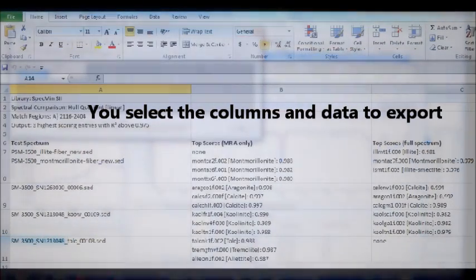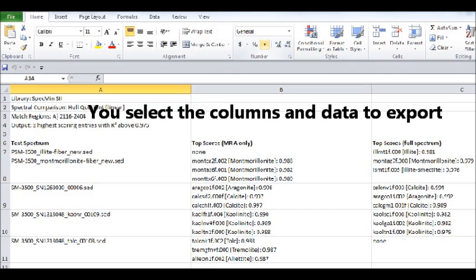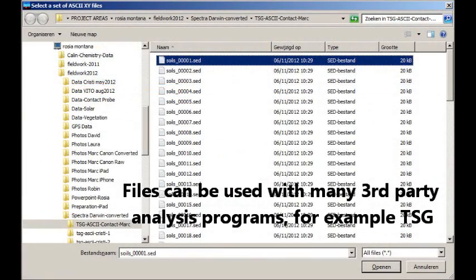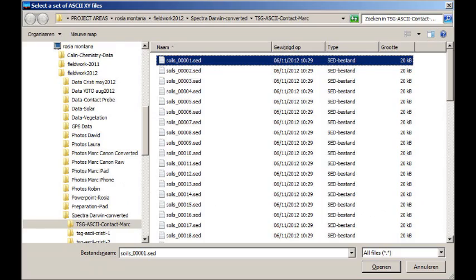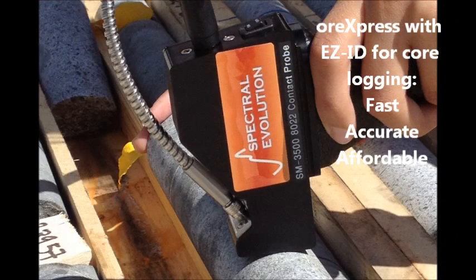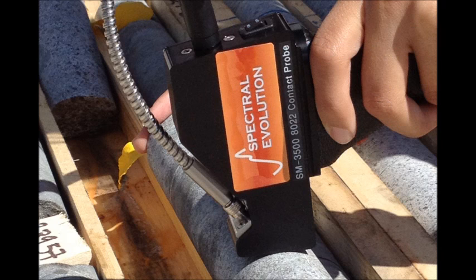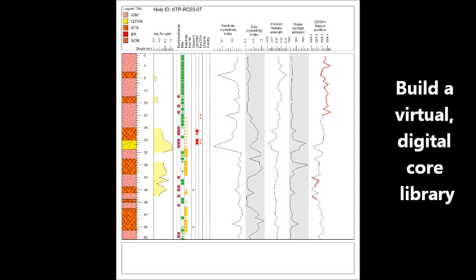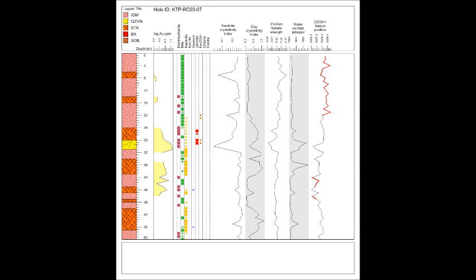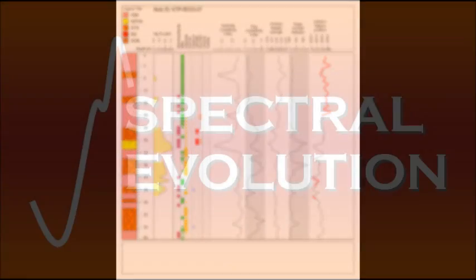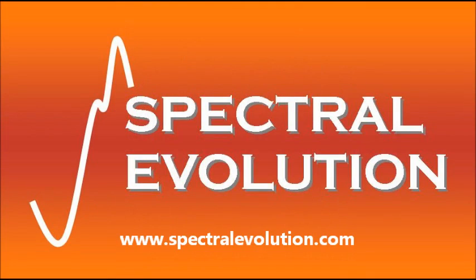To process your Darwin ASCII files into Excel spreadsheet format or import the ASCII files into another software program like TSG. ORExpress for core logging: a fast, affordable, and accurate solution. And best of all, all the data can be saved and used to build a virtual digital core archive that is easy to access, easy to understand, with data collected in a uniform manner and format, and available for current and future projects. Visit www.SpectralEvolution.com.